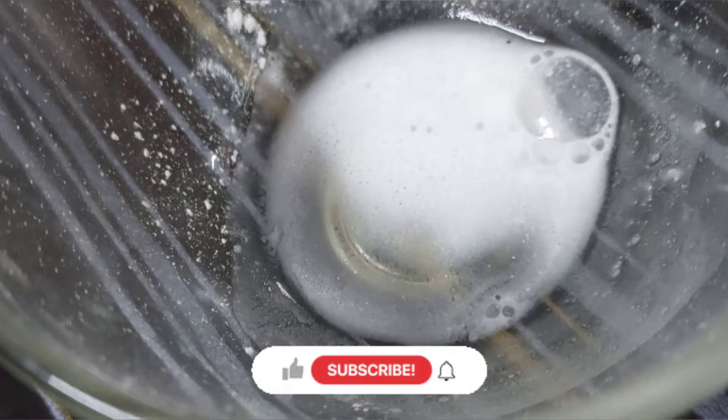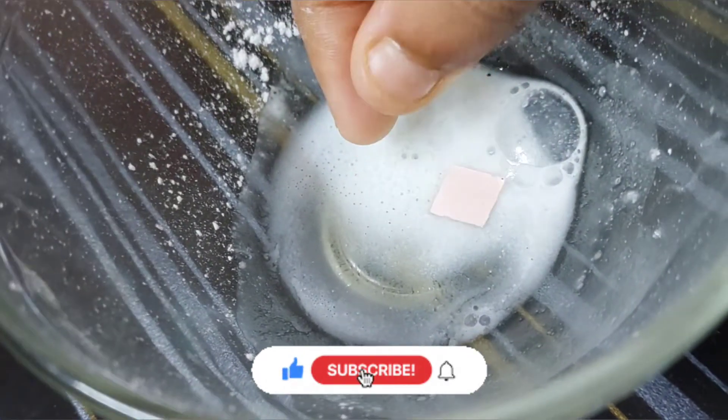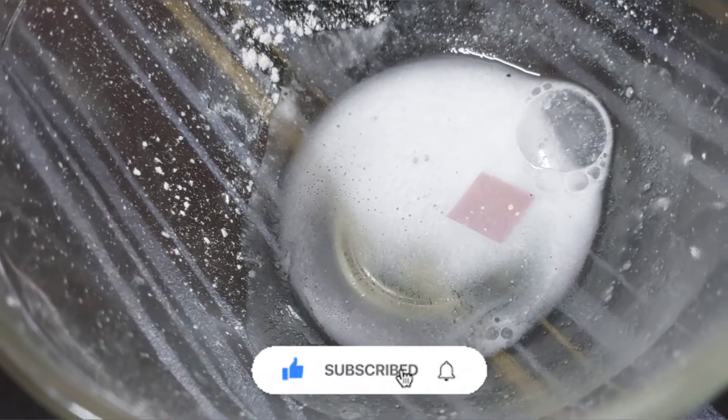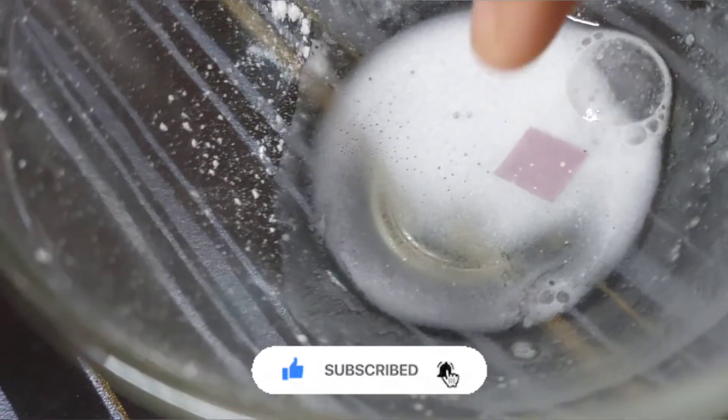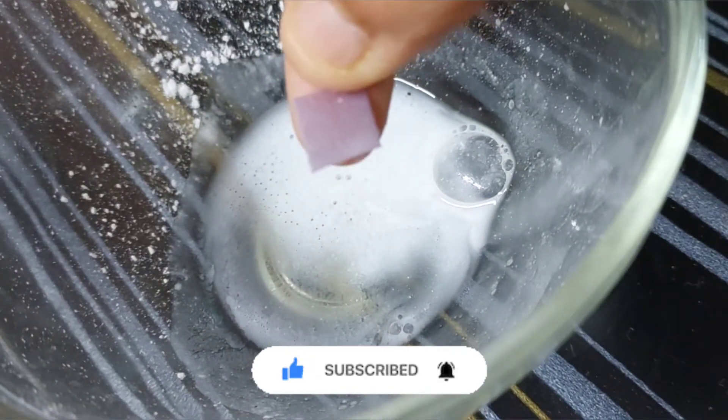Here we have baking soda solution. Now we'll put red litmus paper into this solution and as you can see, it is converted into blue litmus paper. This means that it is basic in nature.